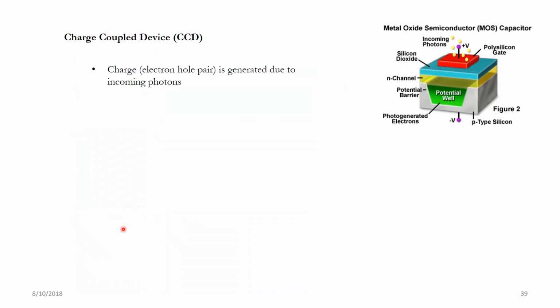So what is a charge coupled device, or a CCD? It's a very simple device, yet an elegant one, because the inventors got a Nobel Prize for designing this device. So what happens is that there's a photoactive layer, light comes in, hits and generates electrons, which are stored temporarily here using a voltage.